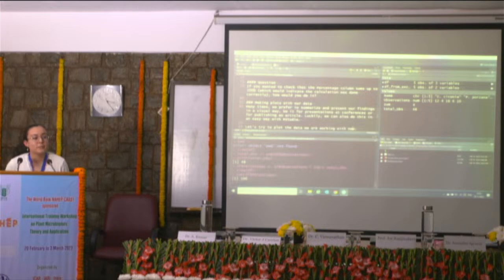And now we can get to a very fun part, which is making the plots. And we are usually very interested in that because maybe we have a presentation at a conference or for a paper or even maybe just for yourself so you can see your data in a visual way and see, okay, well, what's the next step in my analysis, right? So plots are very necessary, and since we're using RStudio, which is great for plots, then we should make plots.